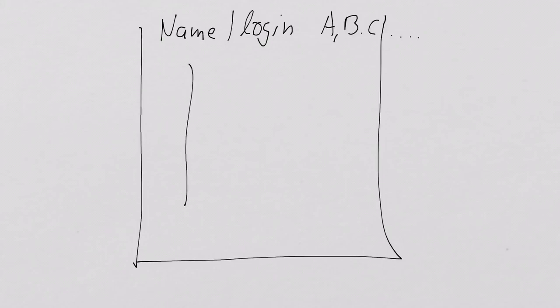On the first page, and this would be preferably a graph paper, which you get in the teaching, this is your graph. Axis labeled and units. And I want this really to look professional.